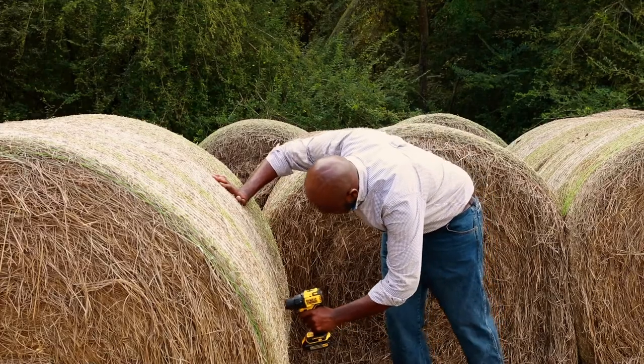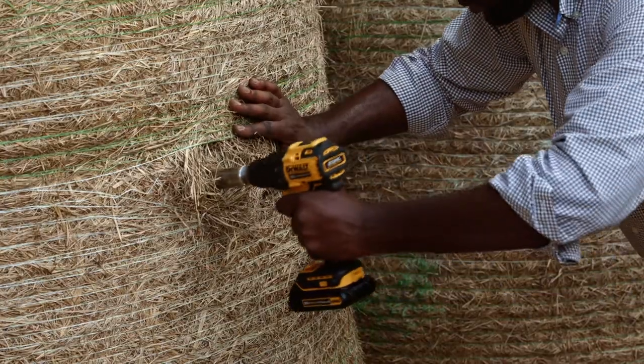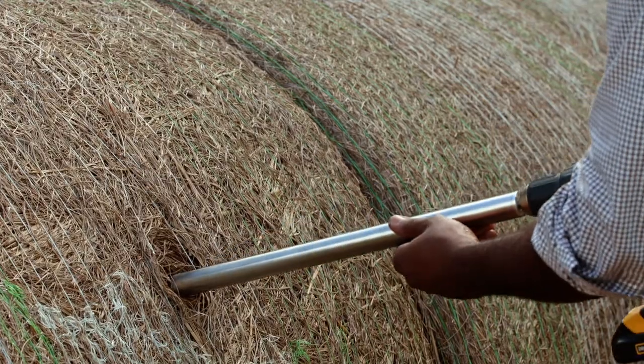Use a hay probe to collect 15 to 20 core samples from individual bales within each lot. Insert the probe into the bale at a 90 degree angle.